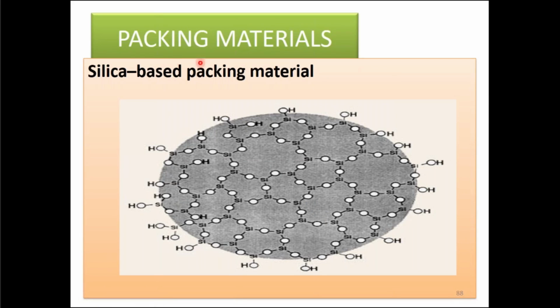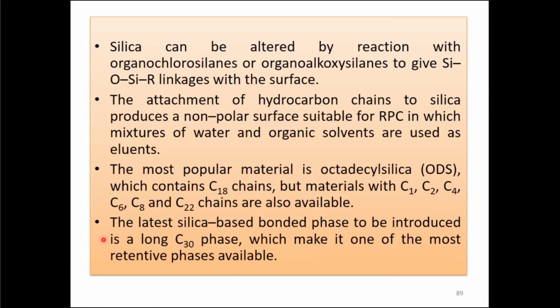And you also will see about the packing material, so how it influences the resolution of your experiment and your separation. Silica-based materials have the silanol groups, SiOH, on the surface. So this OH, if it is present like this, then it will help to only bind the polar molecules to this. But if you want a reverse phase HPLC to be done, then you'll have to modify it.